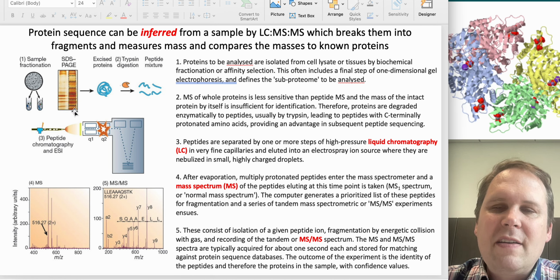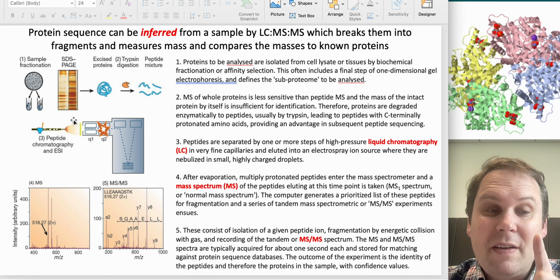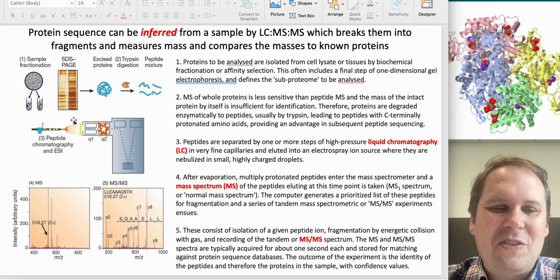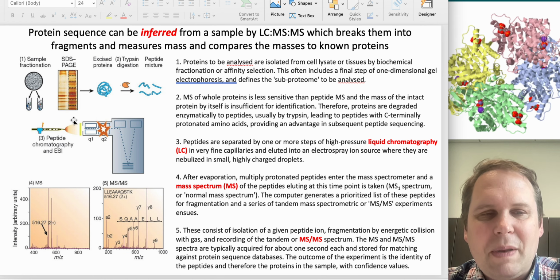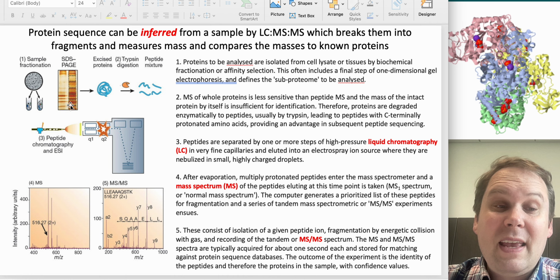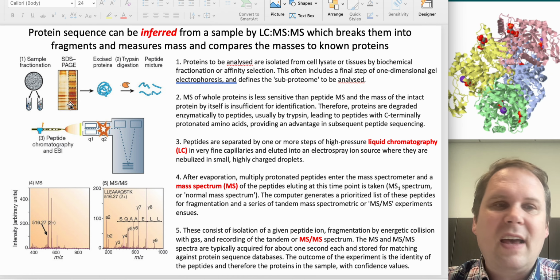Then you're going to take chunks out of the gel that probably contain multiple proteins but of similar size, or at least similar electrophoretic mobility, which is like how fast things travel down a gel. It's not always exactly the same as size. Sometimes charge plays a little role, and sometimes shape plays a little role. Then it's hard to actually get the structure or identification of an entire protein.